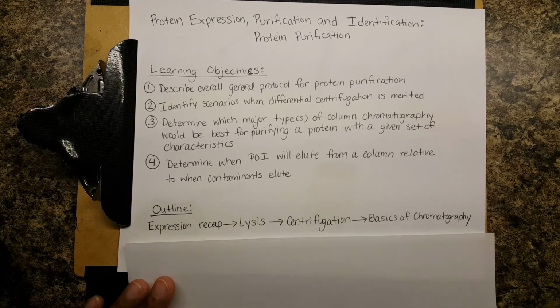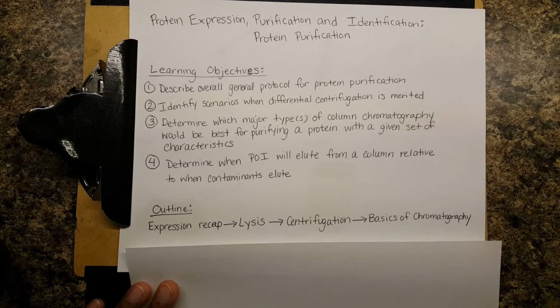Just to give you a roadmap, we're going to recap protein expression very quickly. Then we're going to move on to lysis, centrifugation. Then we're going to cover the basics of chromatography.